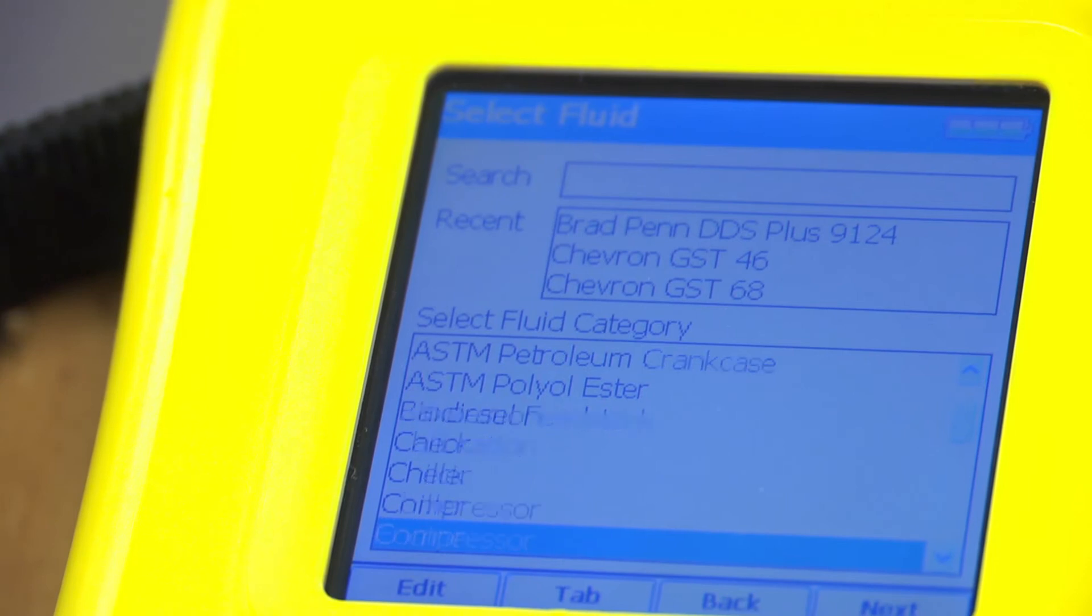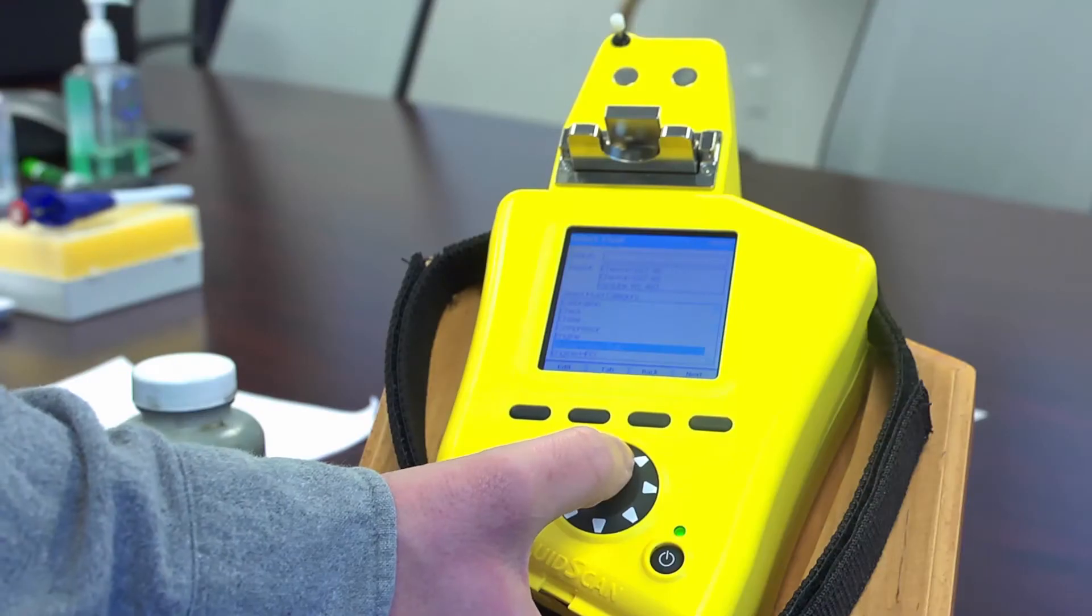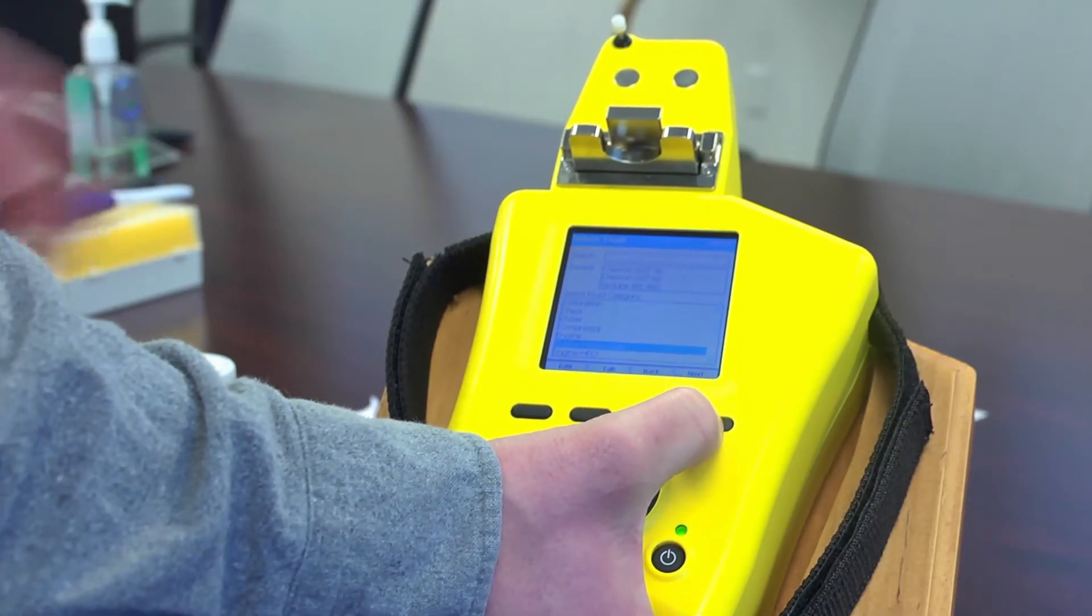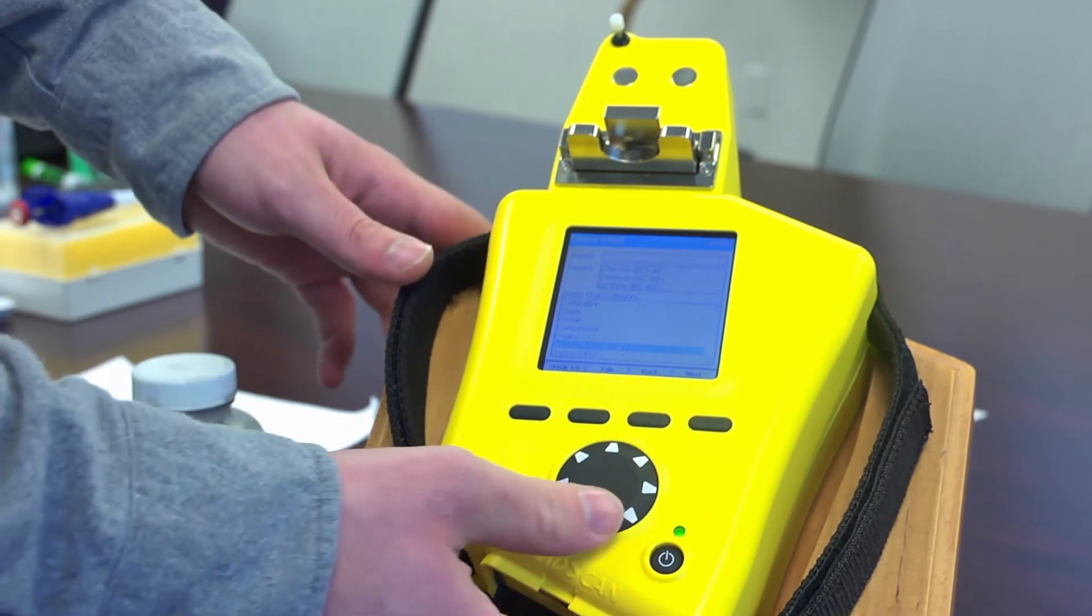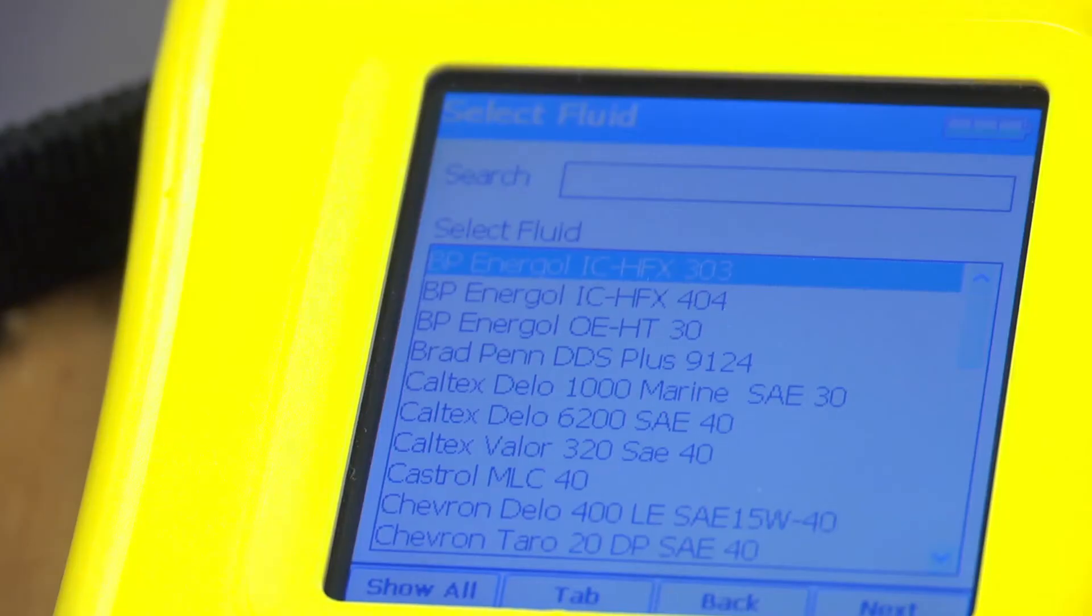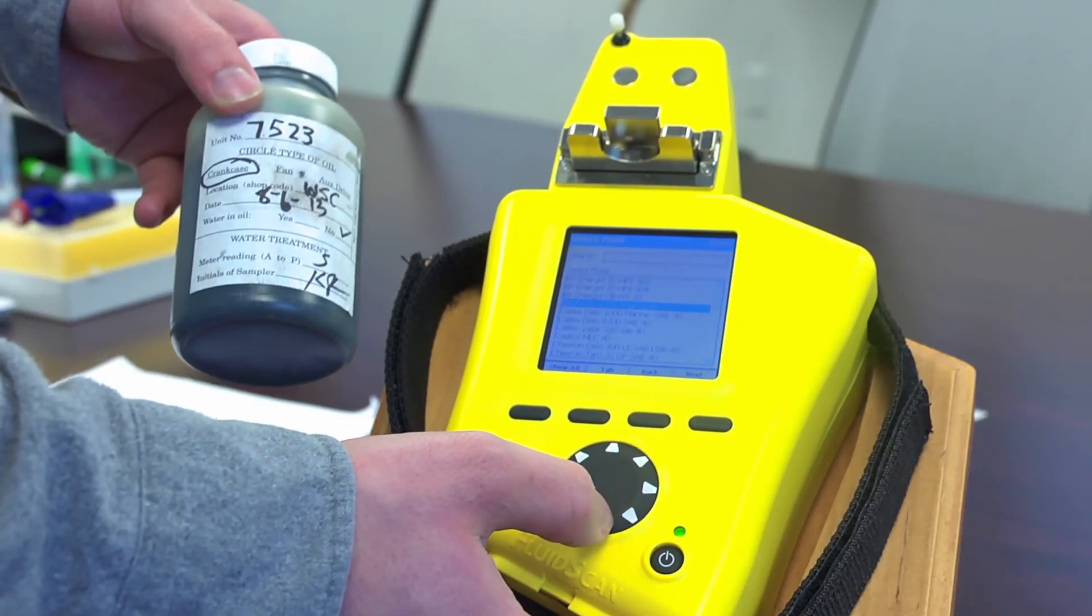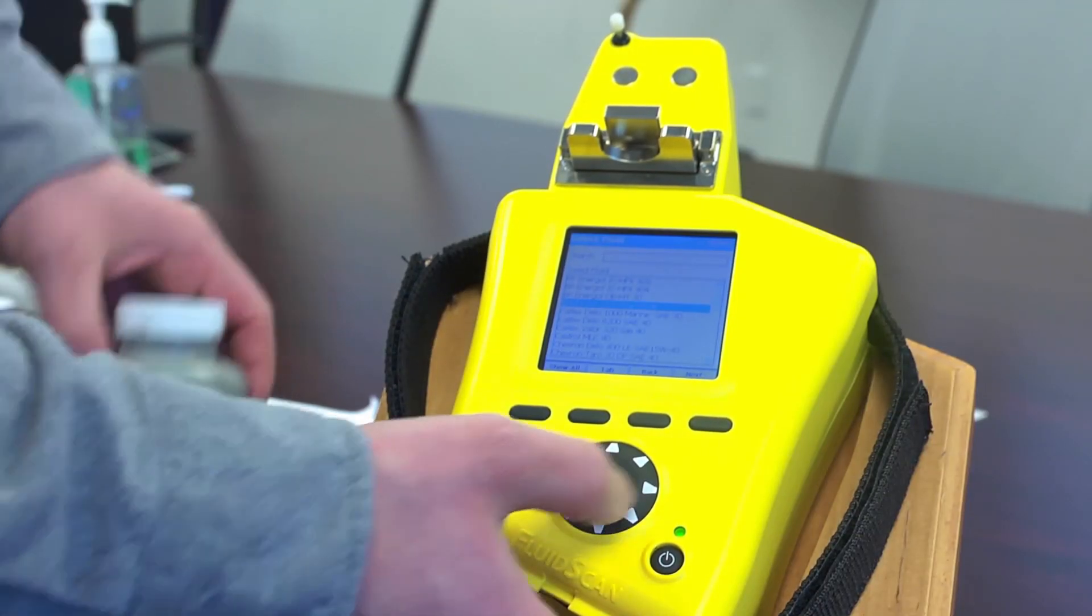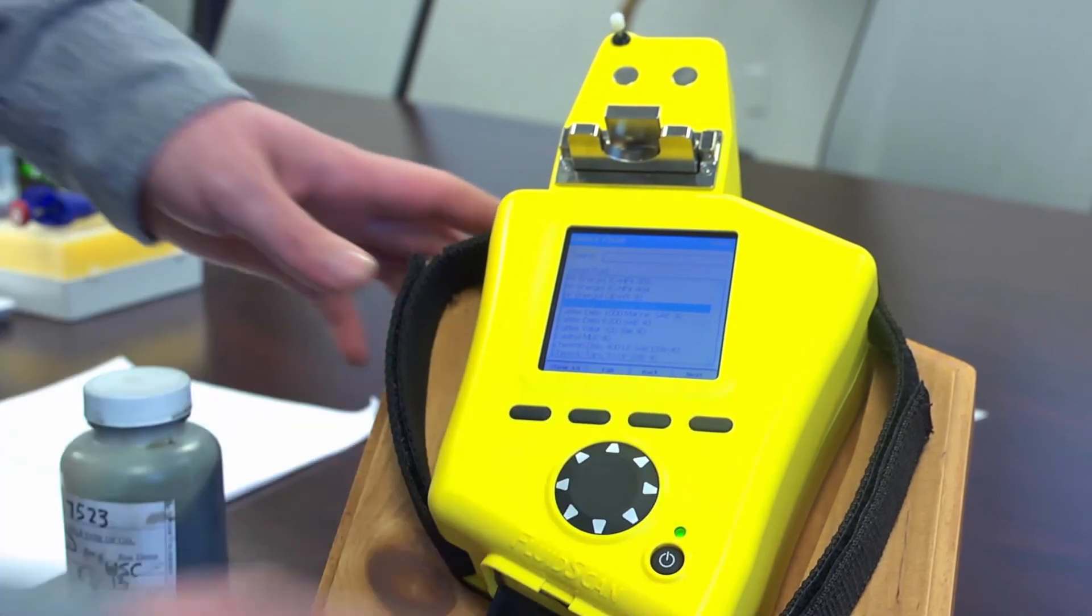So we go to engine heavy duty and hit next. And we select the oil that it is. This is Brad Penn DDS plus 9124. We hit next.